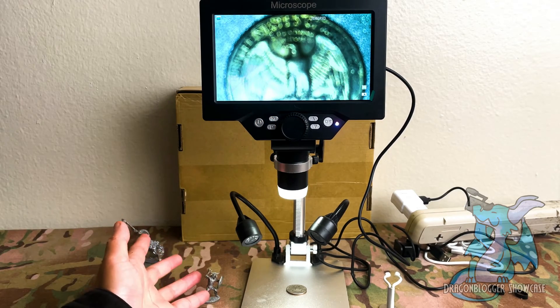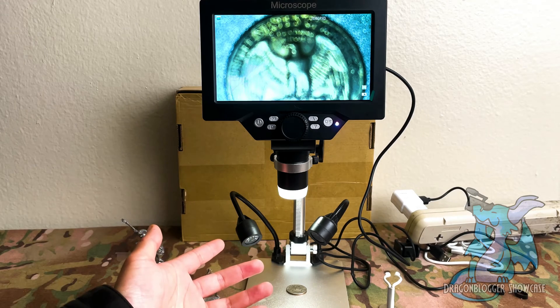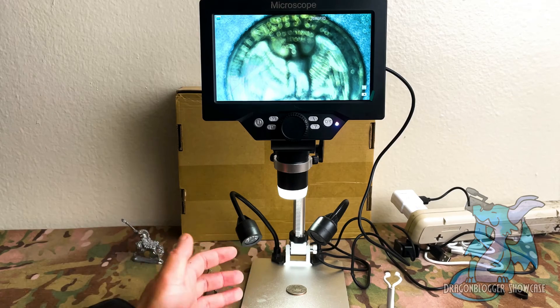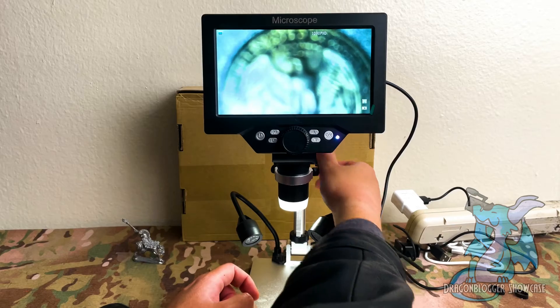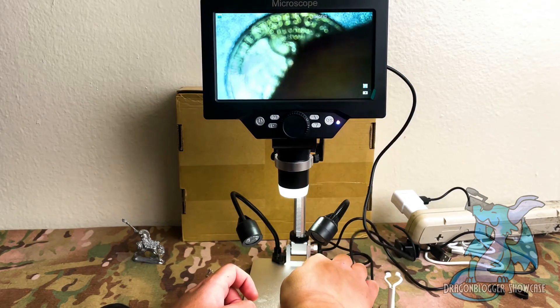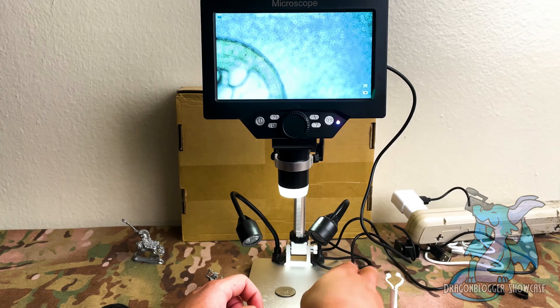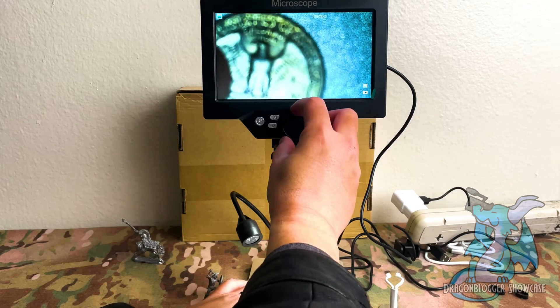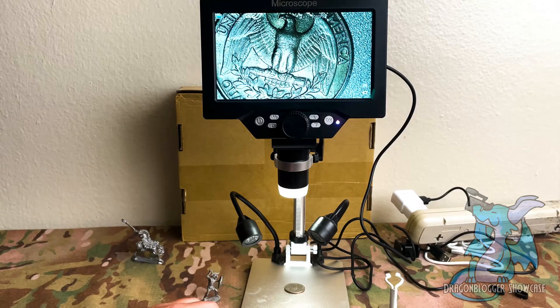Using it is very simple — all you have to do is power it on and it's ready to go. The knob on the side allows you to adjust the height. You can also tweak the angle, though you would need assistance with another tool, as it's pretty hard to maneuver with just your bare hands. The focus is right here in the front and is really easy to adjust.